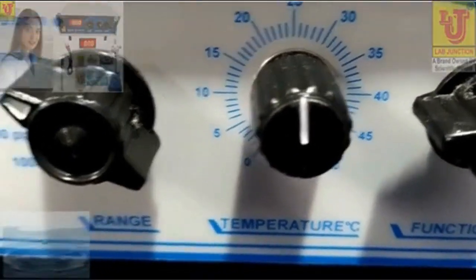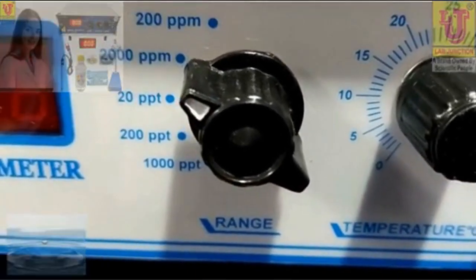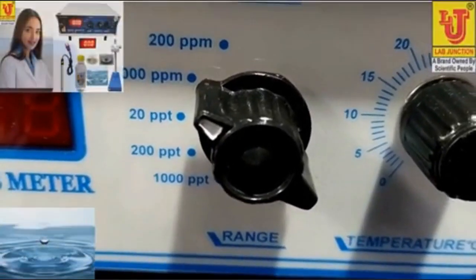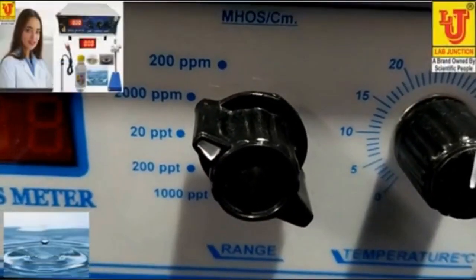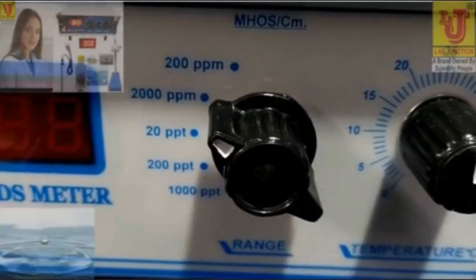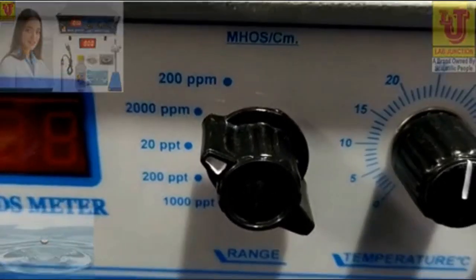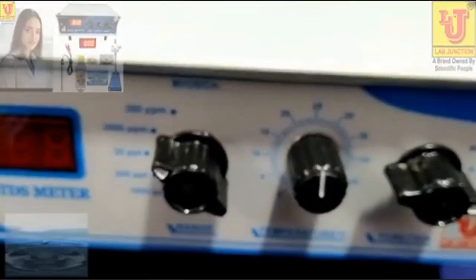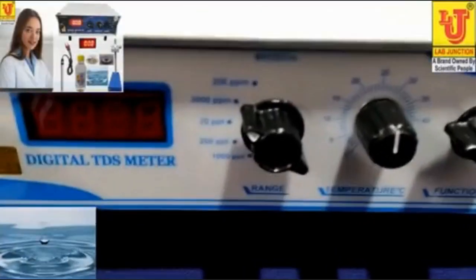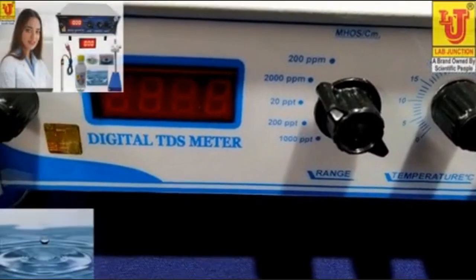Third is range. It has ranges 200 ppm, 2000 ppm, 20 ppt, 200 ppt and 1000 ppt. 5 ranges are available. Now last is the cell constant.